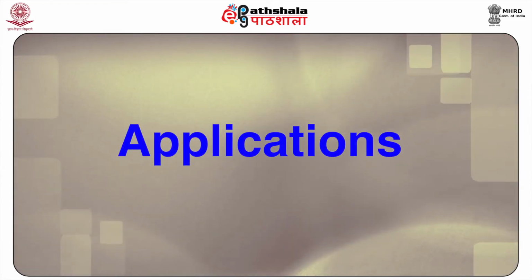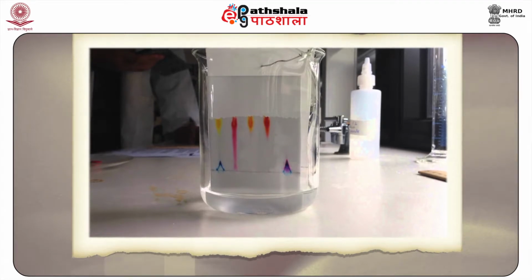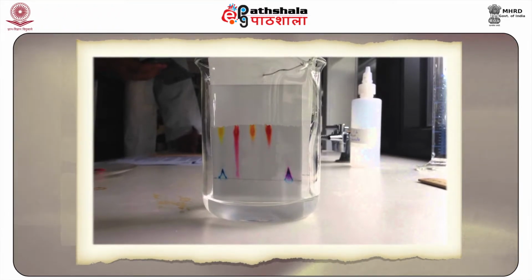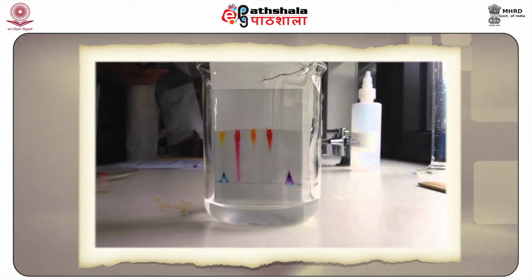Now about the applications. TLC can be used to monitor a reaction's progress, in identifying the different compounds of a mixture, and in determining a substance's purity. Specific examples of these applications may be as follows: detection of toxic materials, including pesticides or insecticides, analyzing the dye composition of fibers and inks, identification of medicinal plants and their constituents having toxic effects, etc.